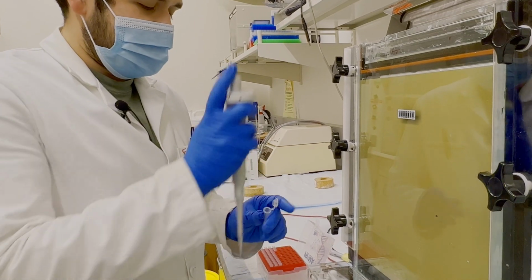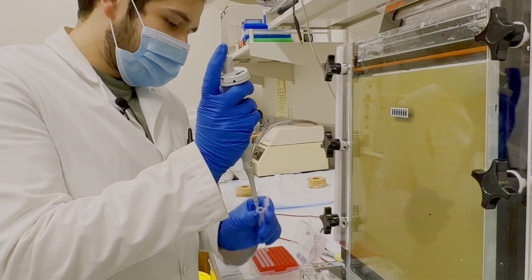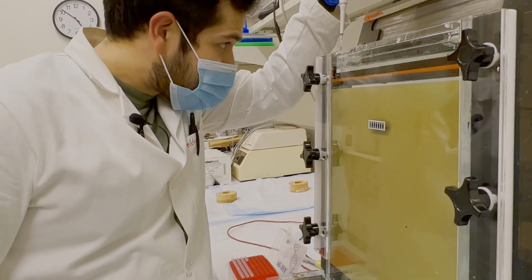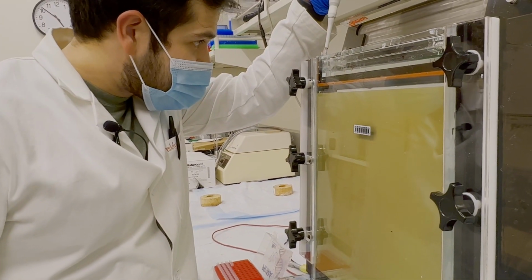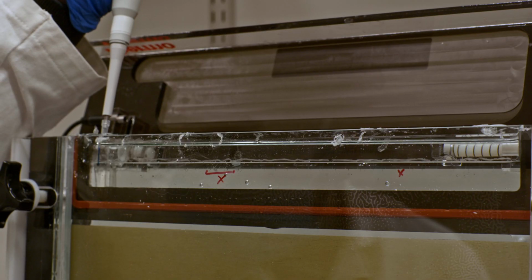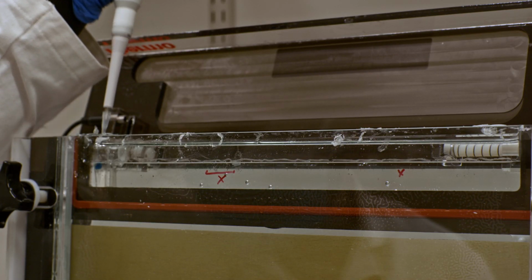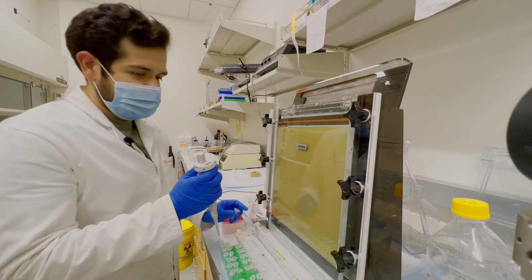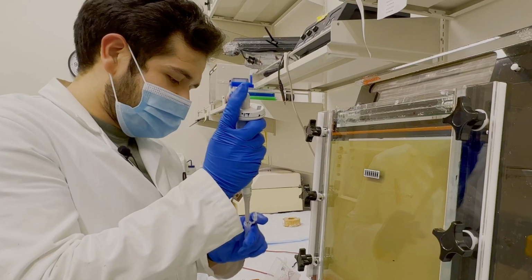Now I'm going to take a 6 microliter aliquot. This can be thrown away into the radioactive waste. Going to find my first well, and yep. And again, because this is radioactive material, make sure you throw away your pipette tips into a container that's for radioactive waste, and the process repeats itself.